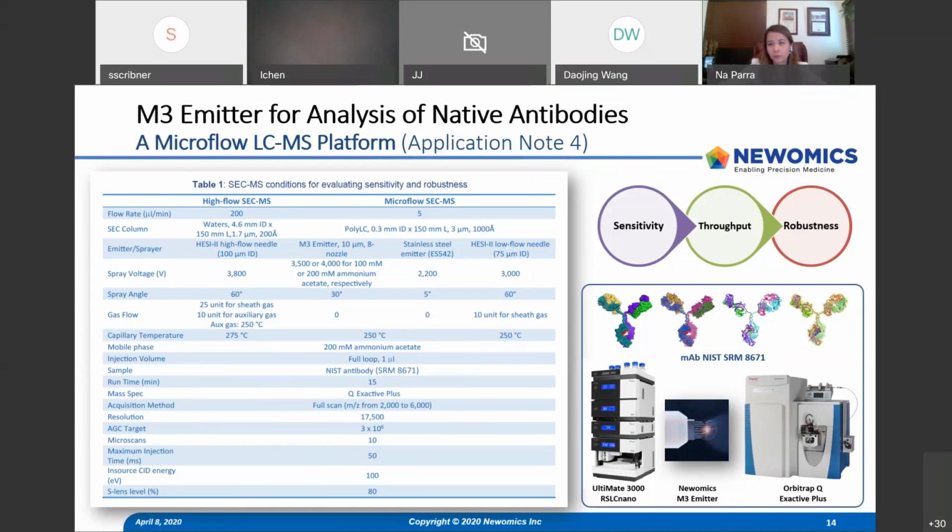This I have to ask one of the scientists in the lab. I don't know whether Peng is here. How often do we clean the mass spectrometer? My understanding is a month, depending on the injection amount, but I don't have the exact number in my head. Is Peng online? Can you answer the question? Okay, yes. That really depends on the mass spec.